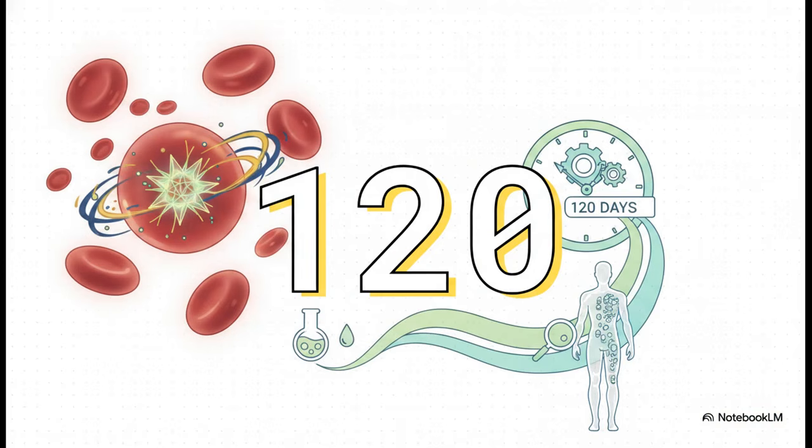Let's ground all of this abstract lab work and spectrophotometry in reality. 120 days. That is the exact standard lifespan of a human red blood cell. And because of this highly consistent timeline, measuring the activity of a specific selenoenzyme called glutathione peroxidase inside these cells acts as an incredibly reliable, long-term functional biomarker. Think about it. A quick blood plasma test fluctuates daily and can be pretty unreliable. But looking at the enzyme activity inside a 120-day-old cell, that gives clinicians a deep, remarkably stable look into a patient's long-term nutritional status and overall antioxidant capacity.